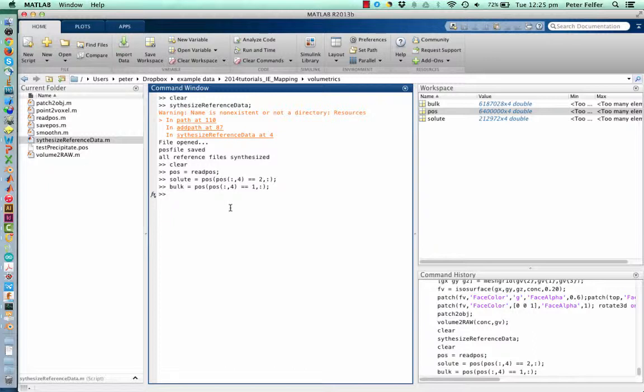Once we've created that, we actually do the voxelisation, for which I've written the point to voxel function. It's a relatively simple function where all you have to type in is, of course, what data you want. The output will be called voxel. It will also produce a grid vector. The grid vector is just 3 vectors, one in the x, one in the y, and one in the z direction, that shows you where the voxel centers are. We need that later for reference geometry.